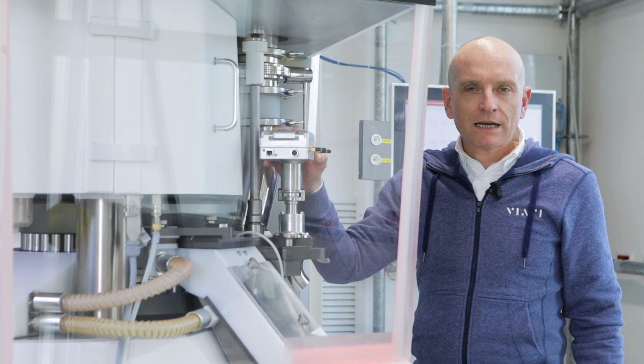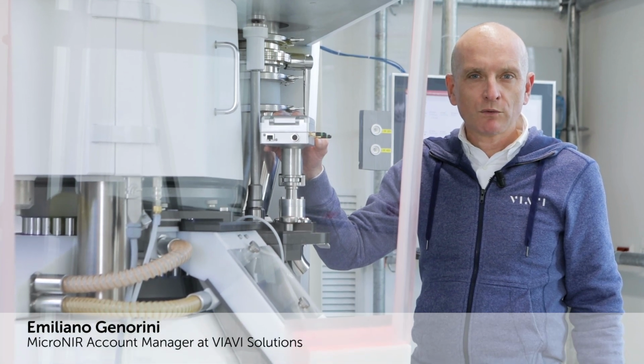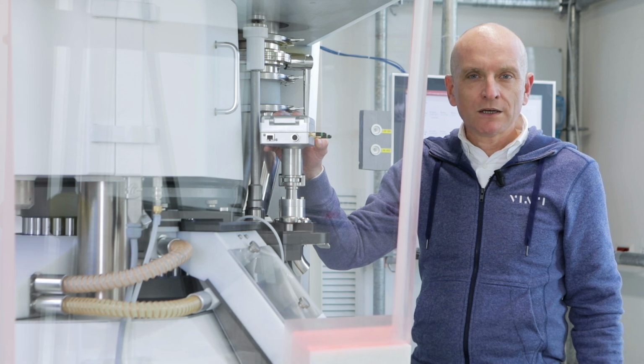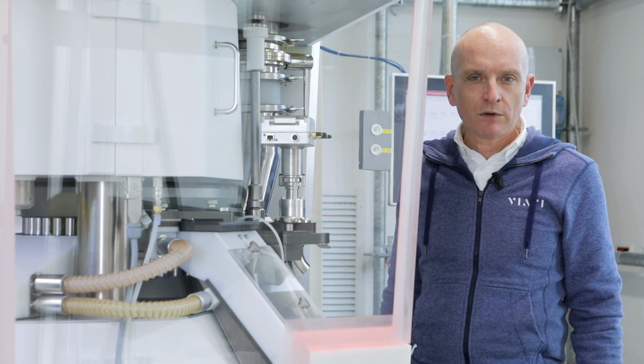PAT deployments are connected to an epochal change in pharmaceutical production, from quality by test, QbT, to quality by design, QbD, with a huge impact on the cost and on the quality of the final product. Using a traditional approach, it is very fast to set up a pharmaceutical process, but in case of out-of-specification, it is very complicated to undertake a corrective action.